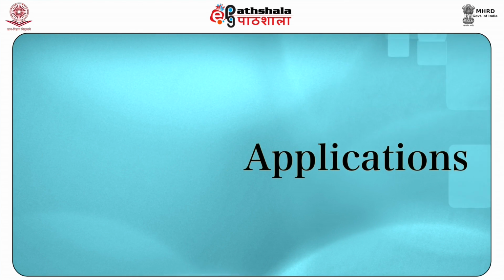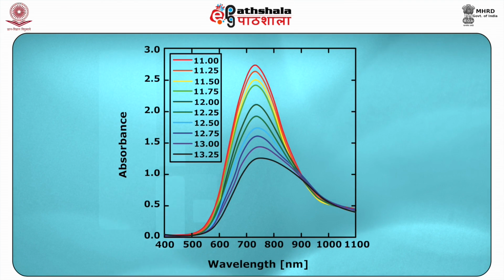Qualitative applications. Specific identification of a compound can rarely be made on the basis of spectral evidence alone. Often the spectrum serves as confirmatory evidence of identity in support of other analytical data. Spectra are recorded in aqueous, acidic, basic and ethanolic or methanolic solution. The wavelengths of the principal peaks and the corresponding absorptivity values are noted for each solvent system.